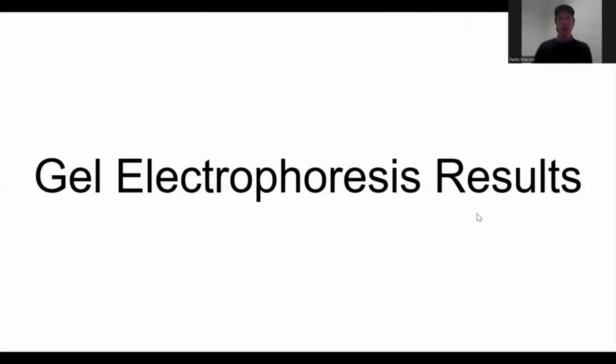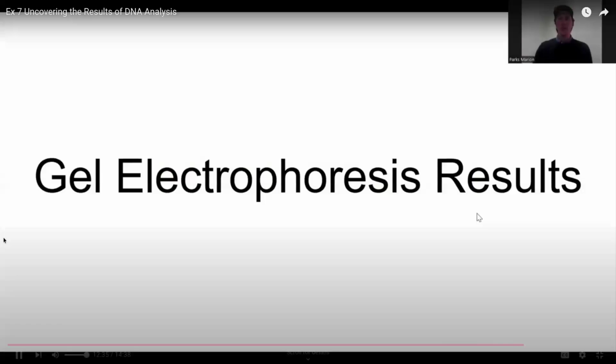All right, we're going to just take a quick look at our gel electrophoresis results. We're going to see examples of all of the three.